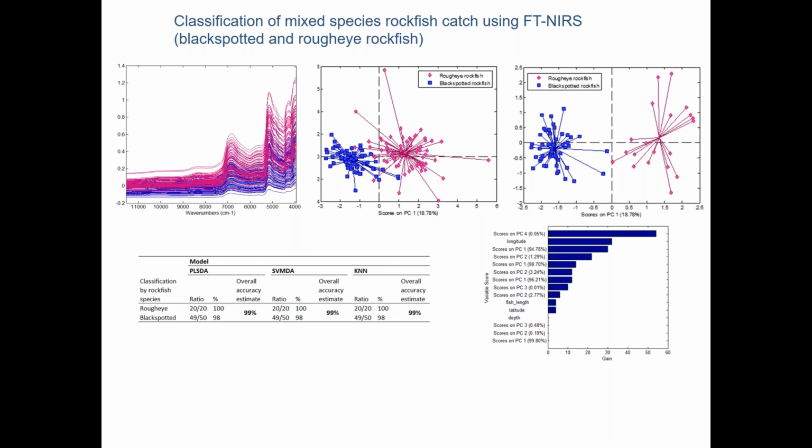Right, okay, so we do not scan the diagenetic otoliths, those that are funky, let's just say. We have been scanning some of them to evaluate whether the different crystalline structure, in terms of aragonite versus, say, calcite in the carbonate, has an effect on the ability to use it for not only aging, but say differentiation in terms of species. So we have not analyzed that data. So I can't specifically speak towards whether those types of otoliths will be useful.